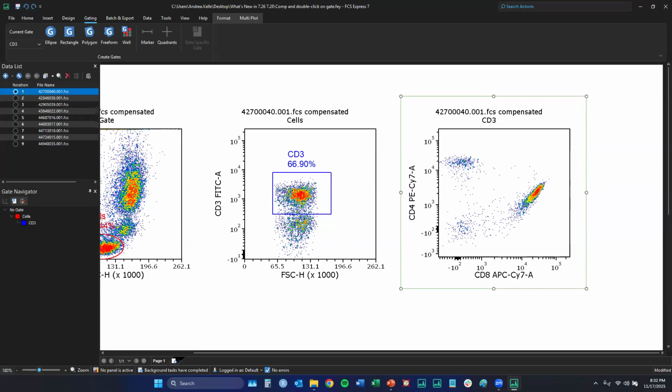And again, oh, well, there is a question. Why are we making it easier for people to manually adjust their compensation matrices? I'm happy you asked this question because I also think that transforming and changing the distribution of the data by manually adjusting shouldn't be done.